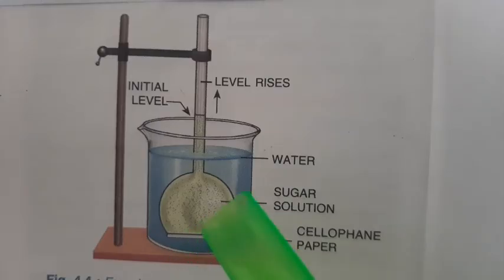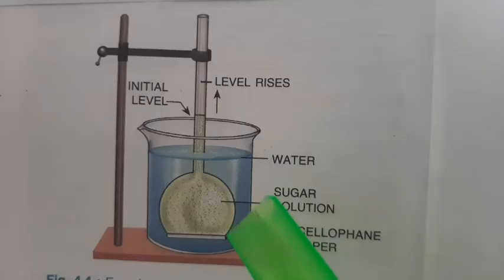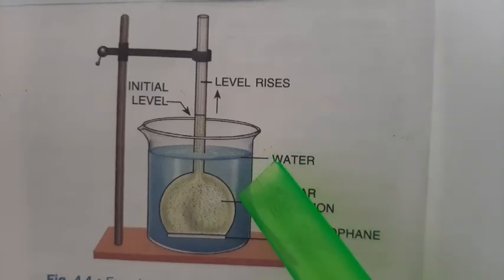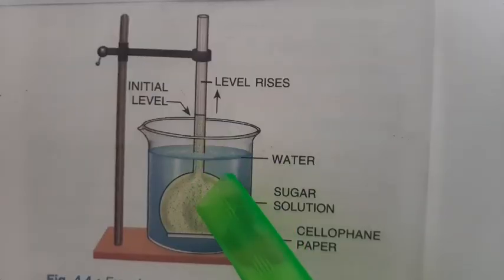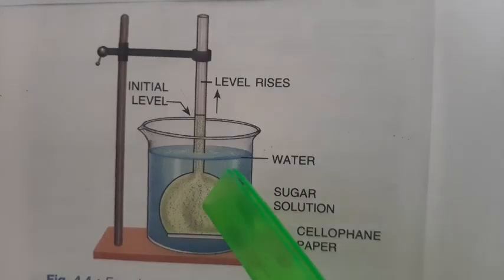Osmosis is the movement of water molecules from its region of higher concentration to its region of lower concentration through a semi-permeable membrane. Where water molecules are more, they will always move to where water molecules are less. Inside, water molecules are fewer because this is a concentrated sugar solution, and the cellophane paper has acted as a semi-permeable membrane.